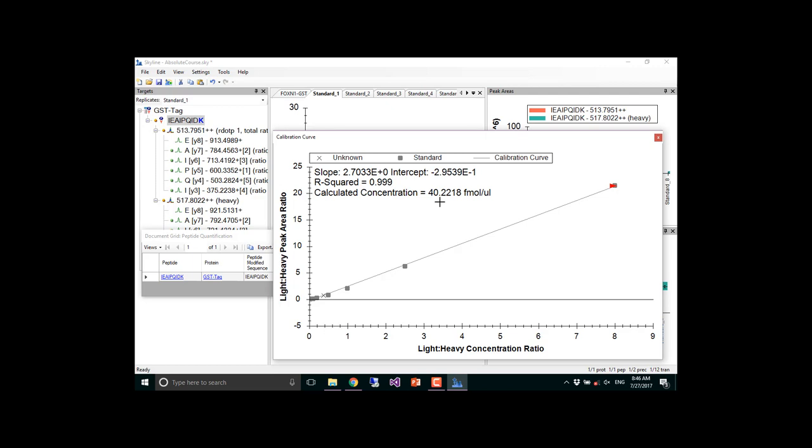Even though we've done a linear fit, the area, this is sort of an expression of residuals, is not necessarily exactly even. You see this little red arrowhead, that's where the point would be on the line, and this is where the point actually is. So they do deviate from each other somewhat.